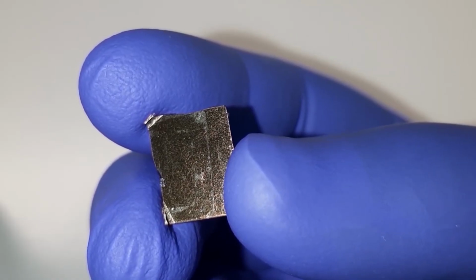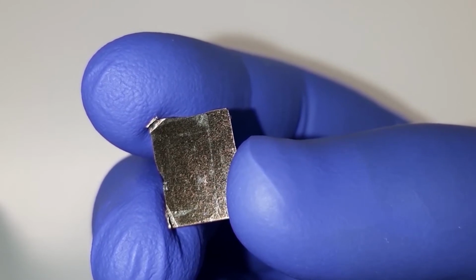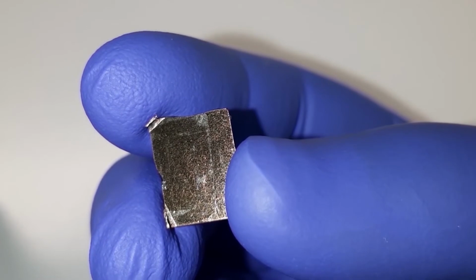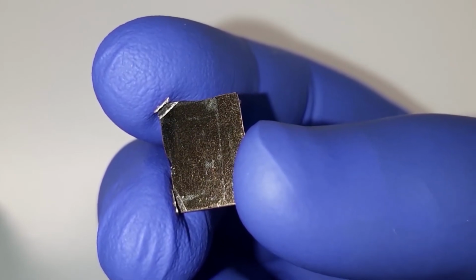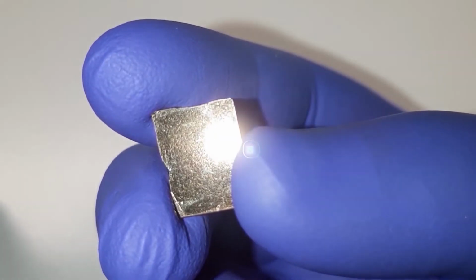Today, I would like to demonstrate to you the optical and mechanical parts of the PAMONO-sensor. And also, I would like to show you small, however very important, parts of this instrument. For example, now you may see a gold sensor chip.